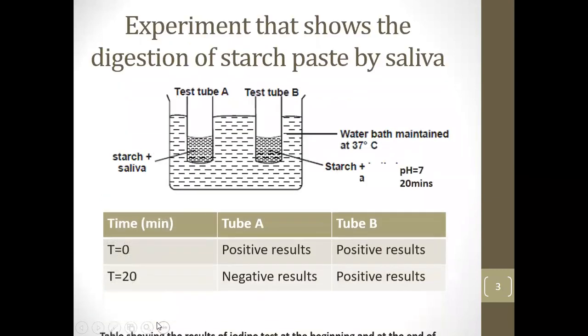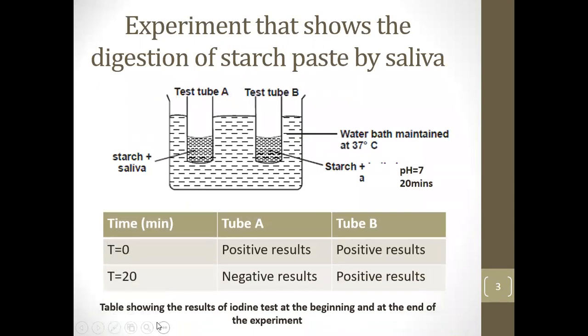But first, I want you to imagine that you are eating a piece of bread. So what taste does it have? Yes, sweet taste. But bread is a carbohydrate food. So where did the sweet taste come from? Don't worry, guys. In today's experiment, we will explain and answer this question. Just focus with me. First, let's have a look at experiment number 1 in our video.